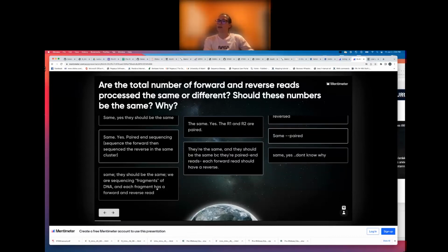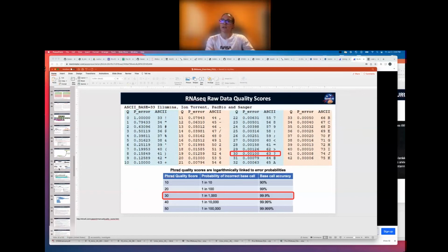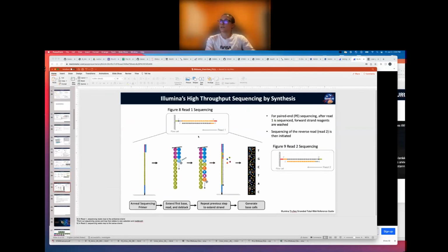Yeah, okay, so I'm just going to quickly jump to here. I actually made this slide during the break for a different reason, but I guess I can use it here. So when we are doing the sequencing, we have this one insert that's depicted here, the forward read, in one of the clusters. And so we're going to sequence in the forward direction. You're going this way.